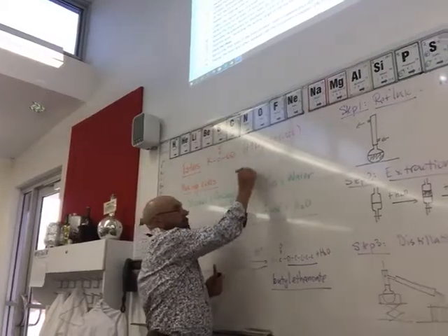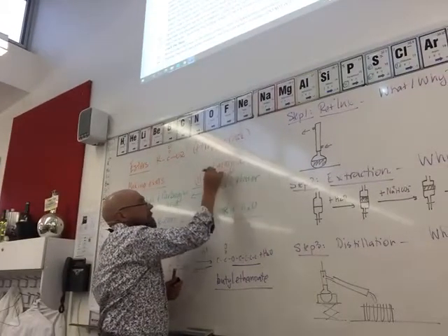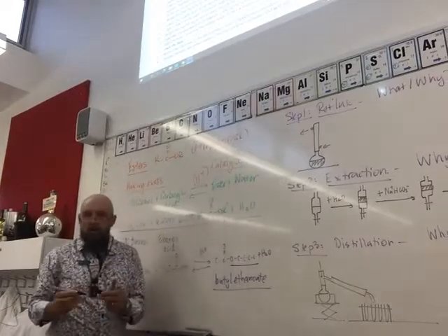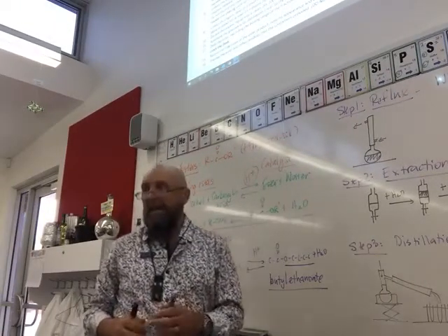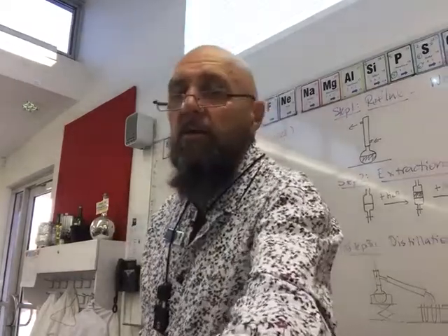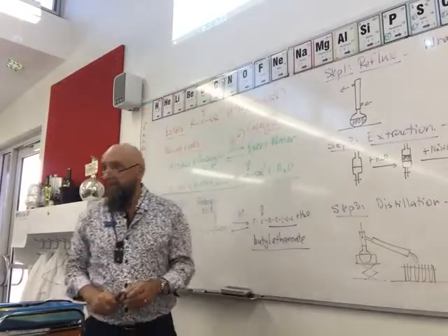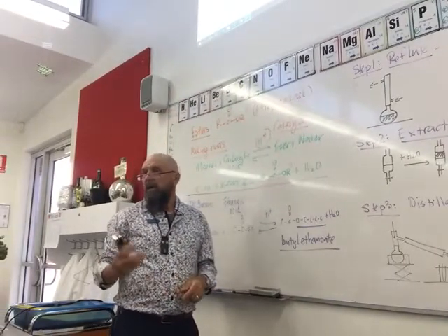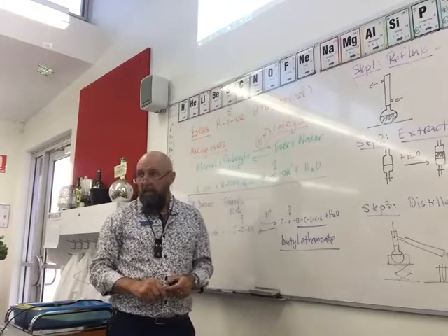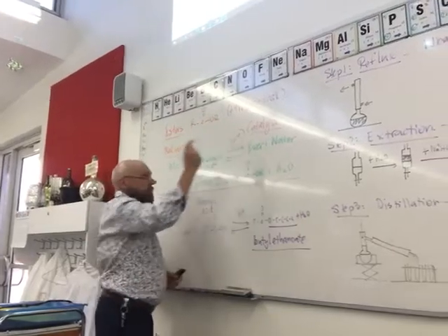The first thing I'm going to talk about is this: catalyst. So we use concentrated sulfuric acid as a catalyst. And concentrated sulfuric acid is something that you probably don't want to get on your hands. That's why we do it in the fume hood over there, okay? And you're very careful about how you handle the acid. You only use a few drops of it to start the reaction off, but we use concentrated sulfuric acid.